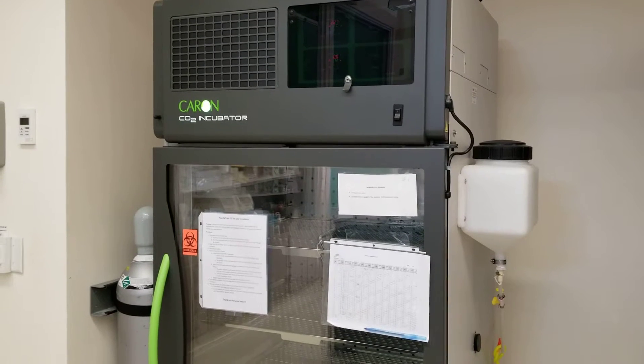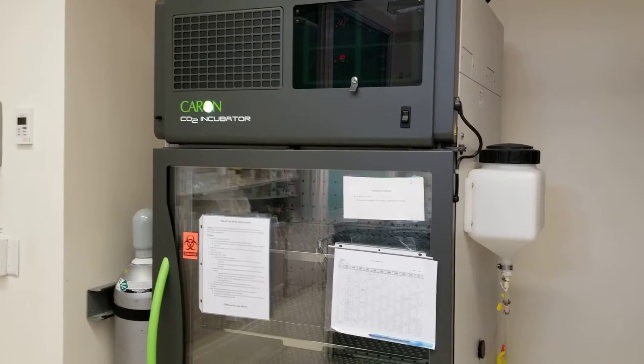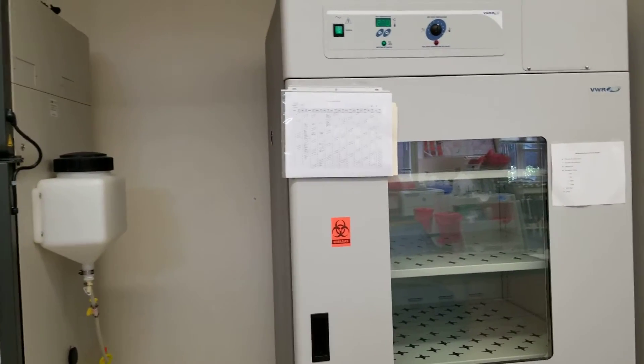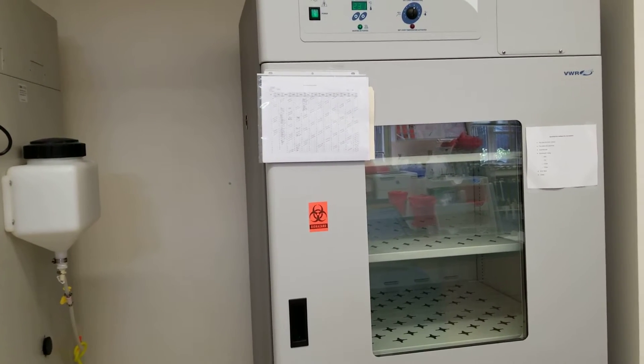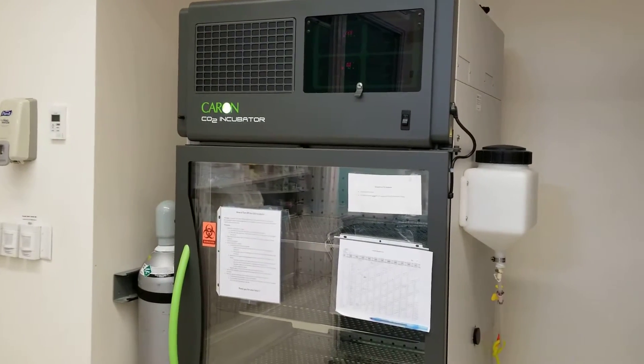Today we're talking about temperatures and where they are in the laboratory in our classroom lab. Here we've got two incubators: we have the room air or non-CO2, also known as O2 incubator, and here we have the CO2 incubator.